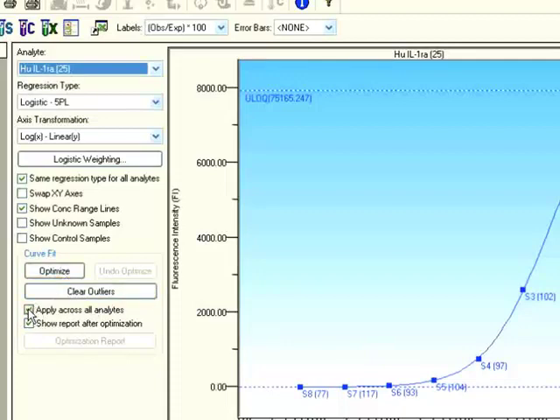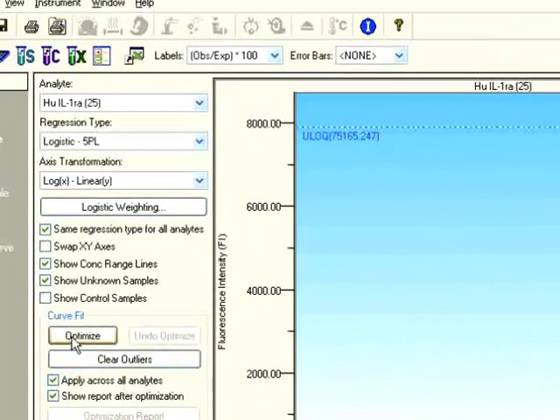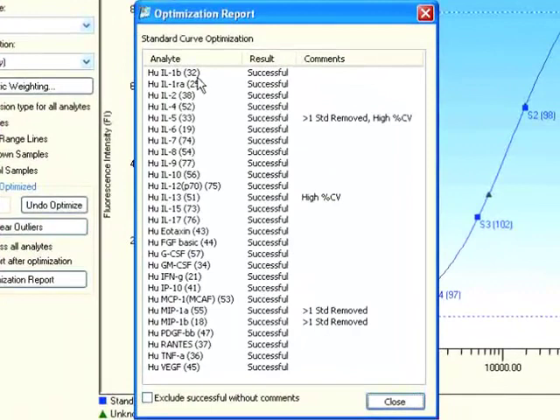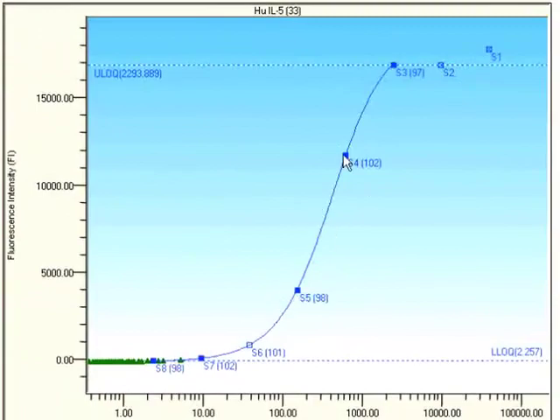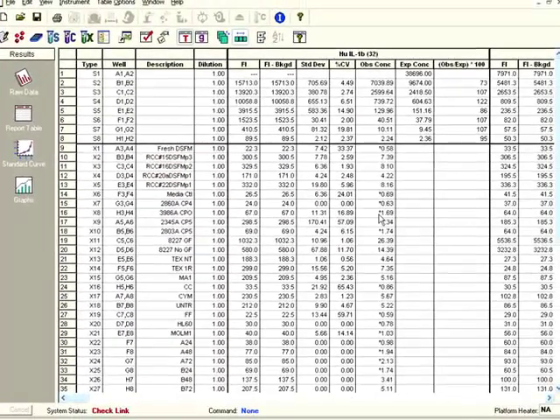All you have to do is click 'Apply across all analytes' and then click 'Optimize.' What's also nice about version 6 is you can show the unknowns on your curves as well, so we can see where our unknowns are fitting on the standard curve. Now I can optimize across all the analytes — it's optimizing all 27 analytes automatically. It goes through all 27, recalculates the standard curves, and gives you a report of what it did. In most standard curves there was no issue; in a few it removed the highest standard, and in a couple it noticed a high percent CV between the two replicates. Now click 'Close' and all the data points on the standards are automatically fitted. So, everything is done for you, and you can confidently go back to the report table and analyze your data.